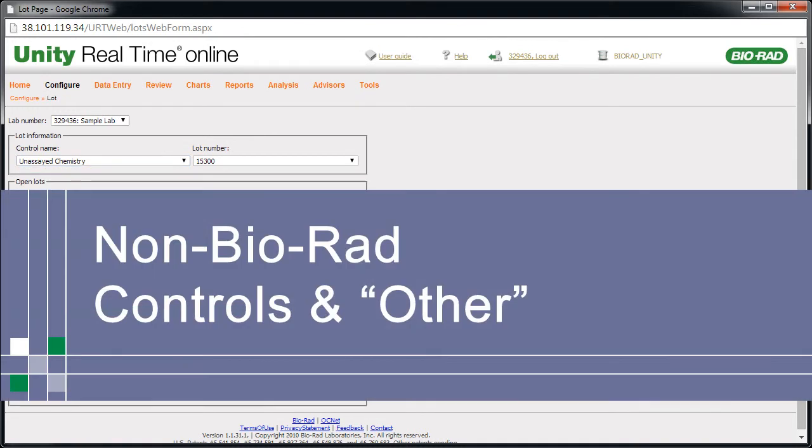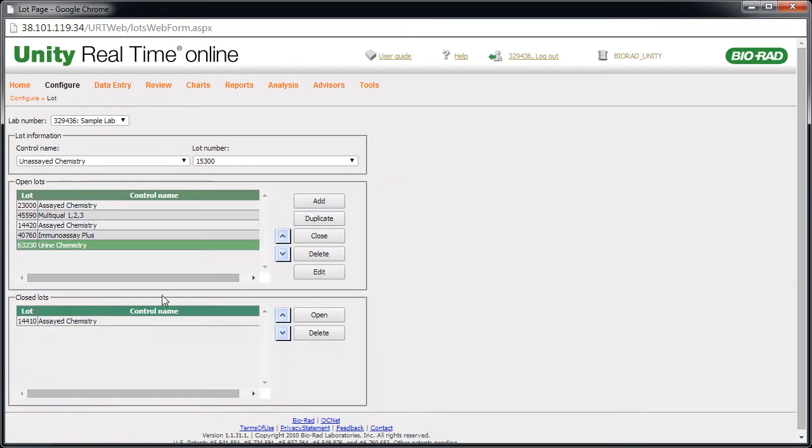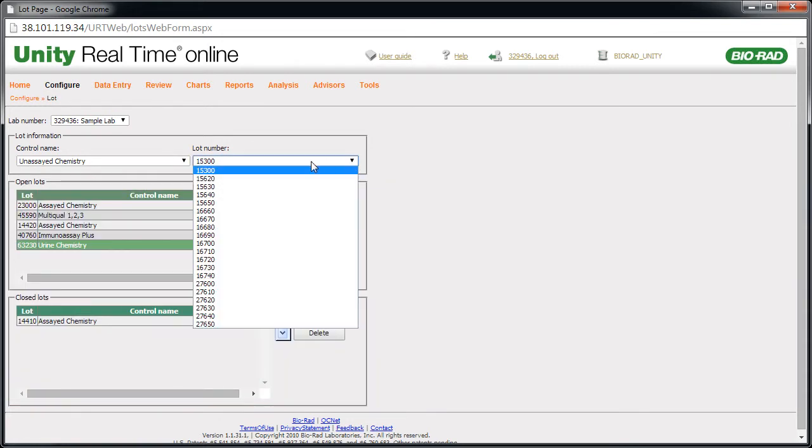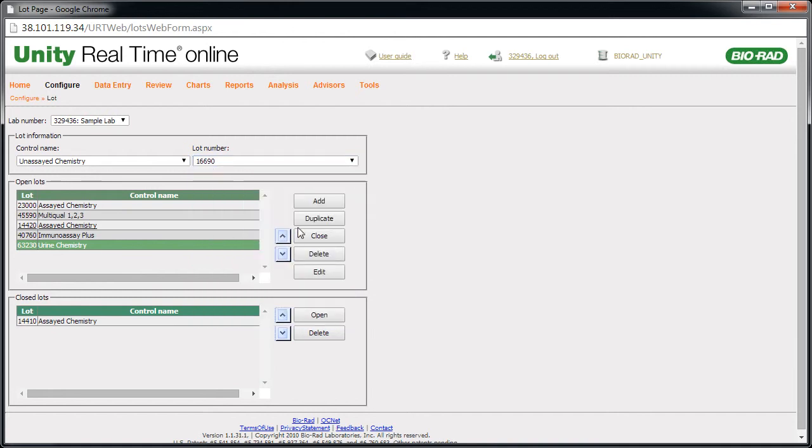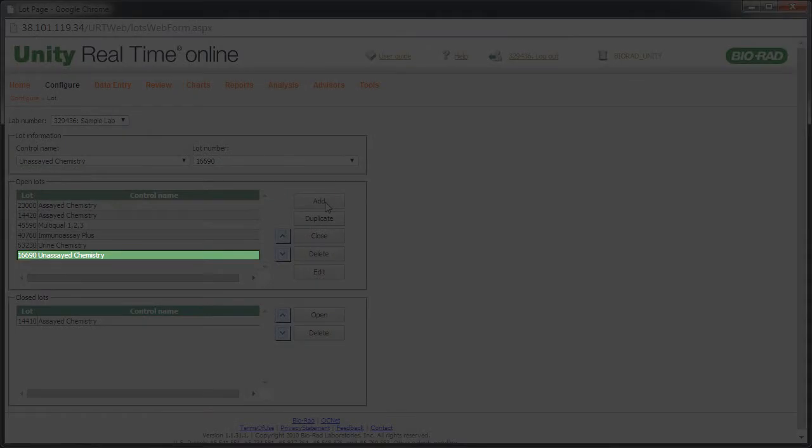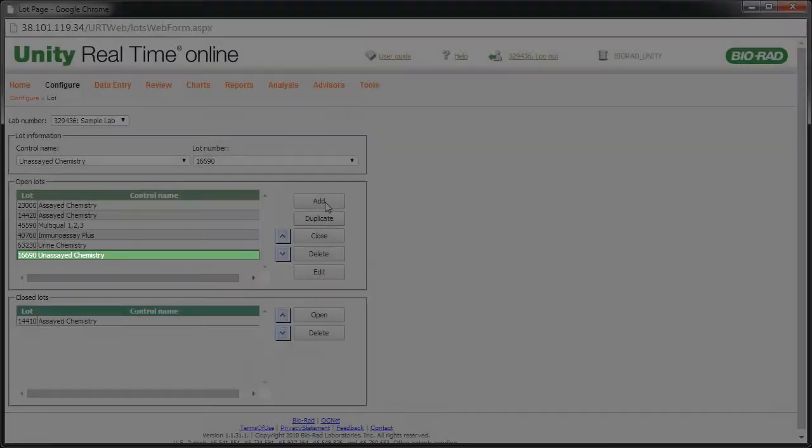Note that non-Biorad controls may be set up. Please refer to the user guide for details. Select the lot number. Then click Add. The lot is added.